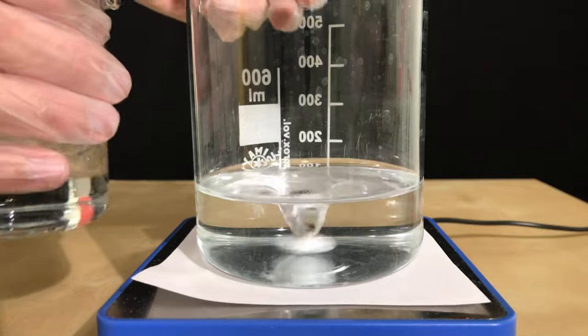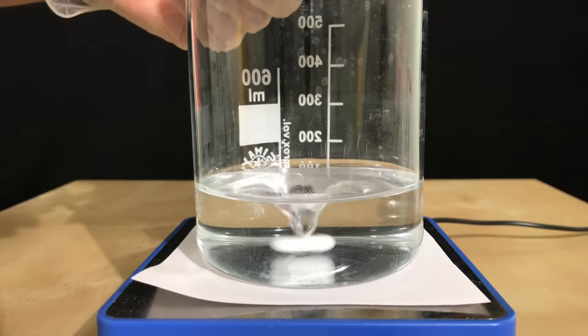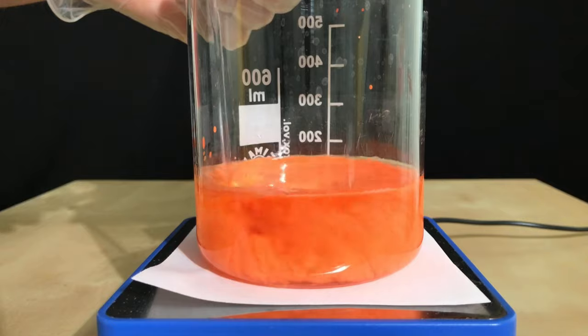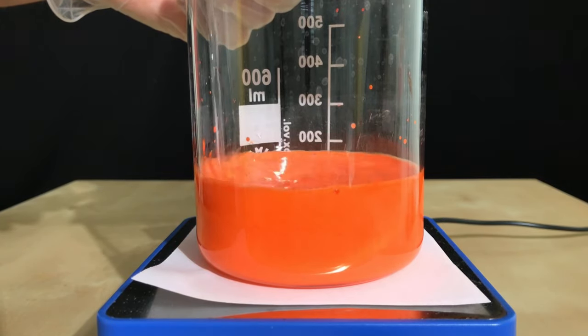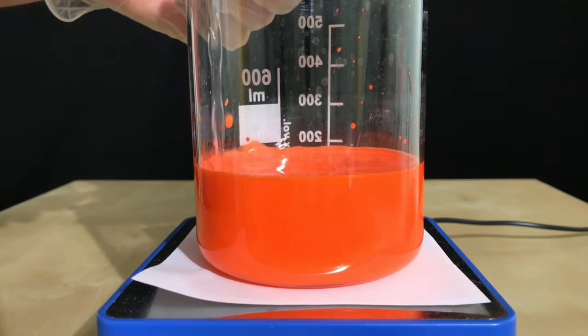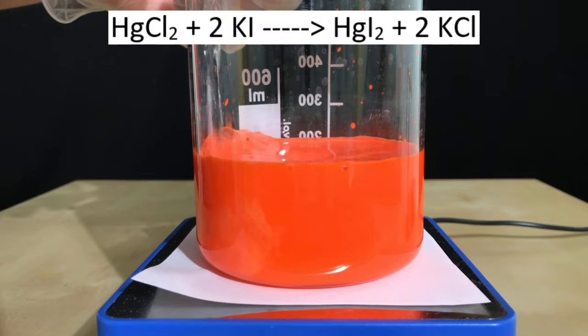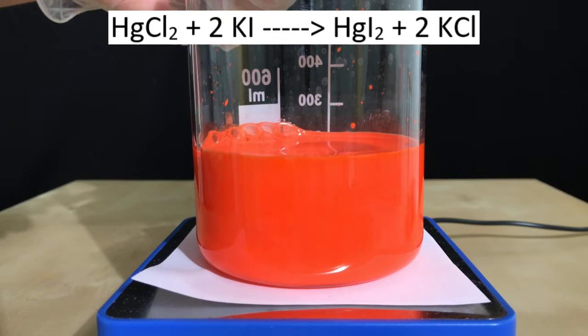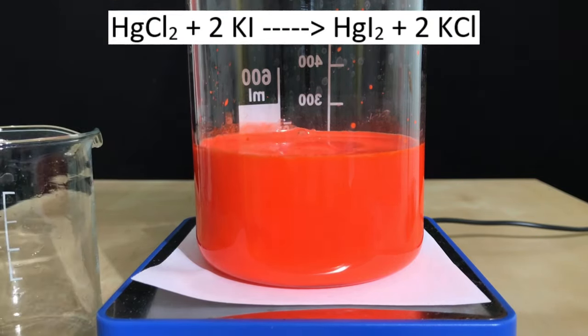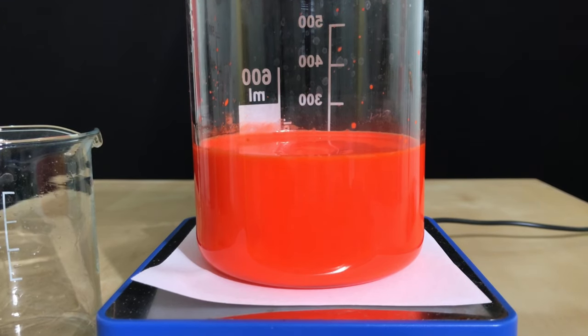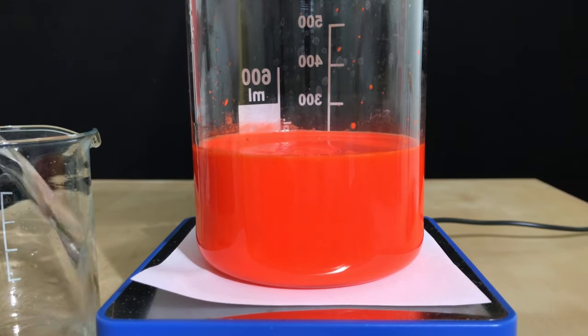Once the mercury chloride had finally dissolved, it was time for the fun part. We simply have to combine the solutions. As you can see, a red precipitate of mercury-2-iodide immediately crashes out. The reaction taking place is known as a double replacement reaction. Mercury-2-chloride reacts with potassium iodide to form mercury-2-iodide and potassium chloride.